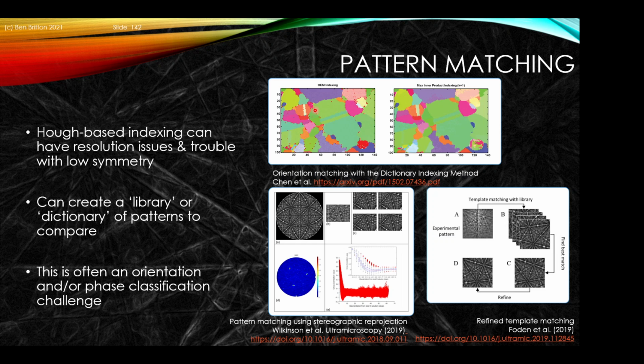improved indexing specifically towards grain boundaries and also defects inside grains. So what you basically do is you sample multiple diffraction patterns from a reference dynamical calculation, and you try and find the best matching orientation with a well-spaced orientation spread. And so this shows the matching as plotted on this pole figure for the particular orientation of the input diffraction pattern and the output.